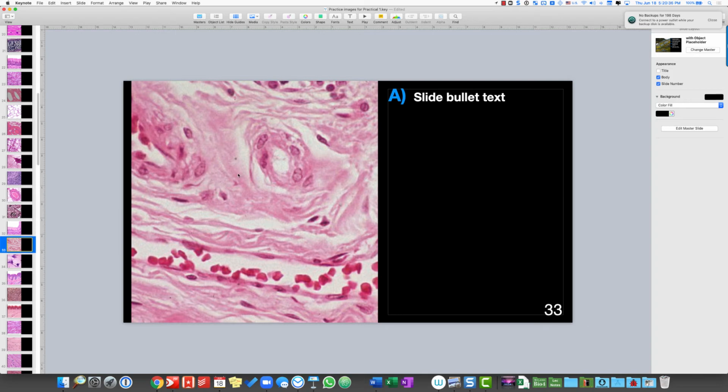Okay, so what am I looking at here? Well, this is actually a blood vessel. Okay, you can see the red blood cells in here. But what I wanted to show you is just this simple squamous epithelium. Okay, so this is a capillary.